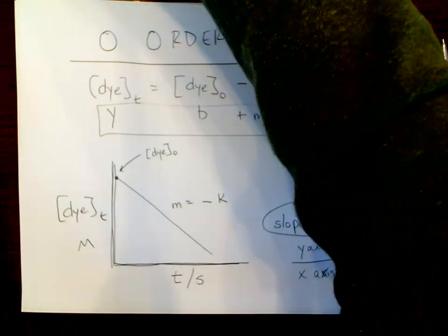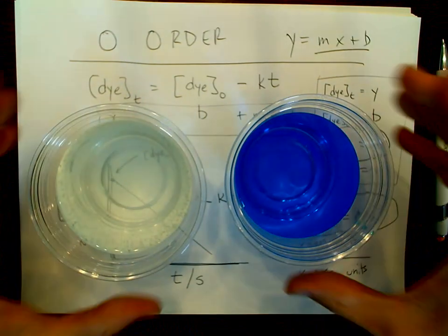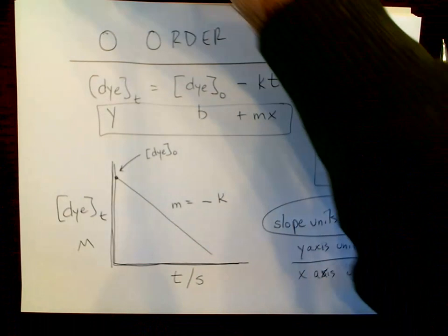Now let's just check out what our cups are doing here. I mean, this is almost gone. That reaction is almost done.